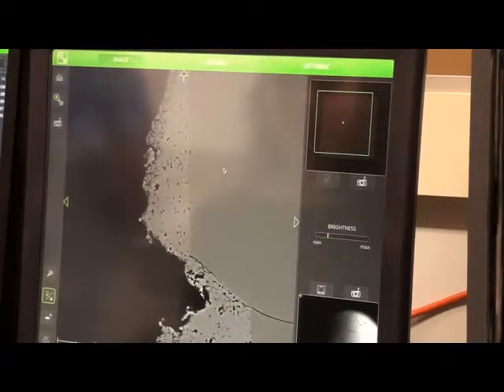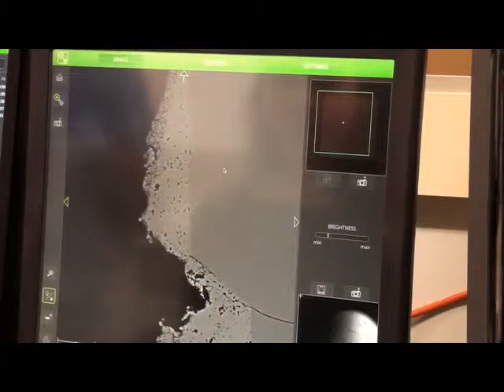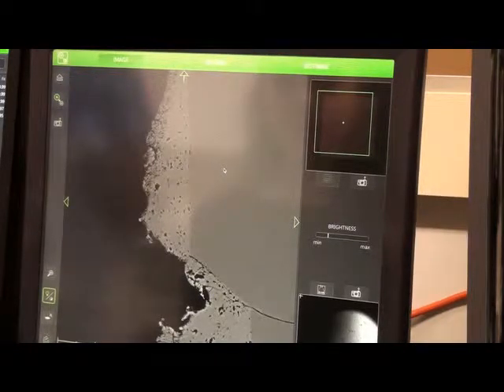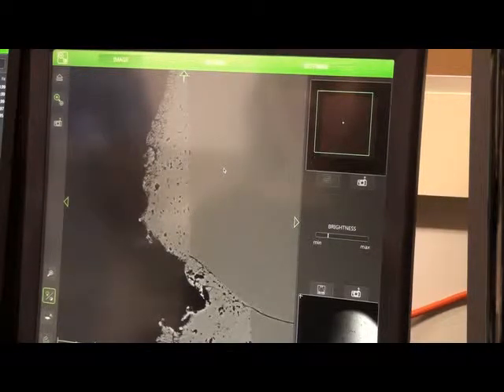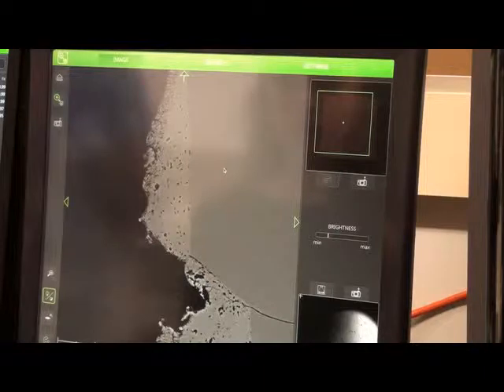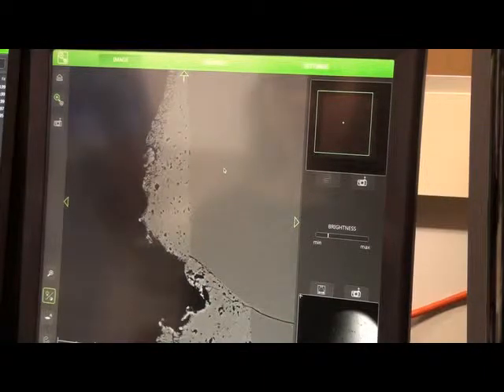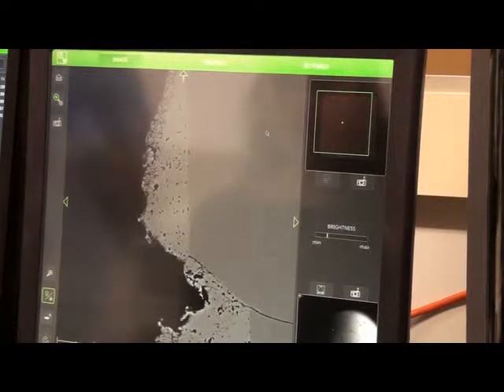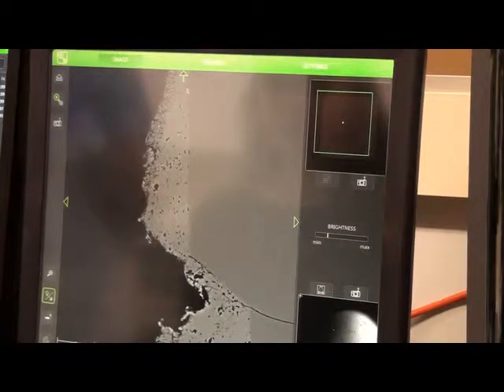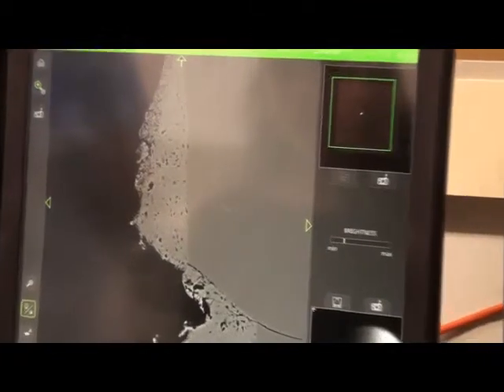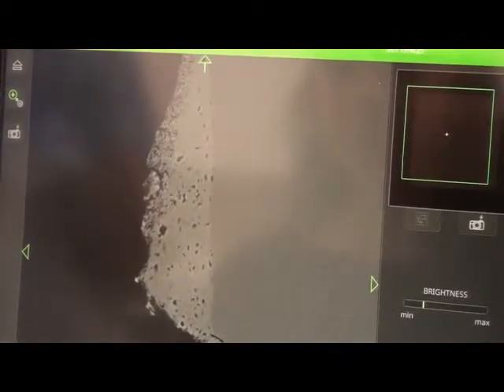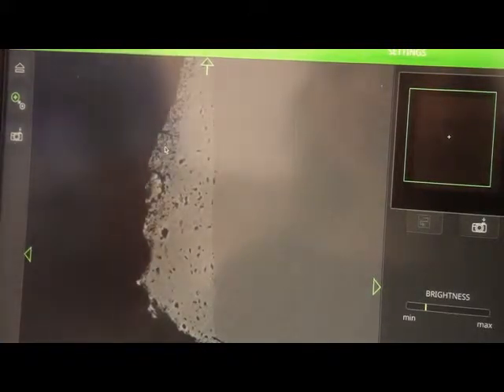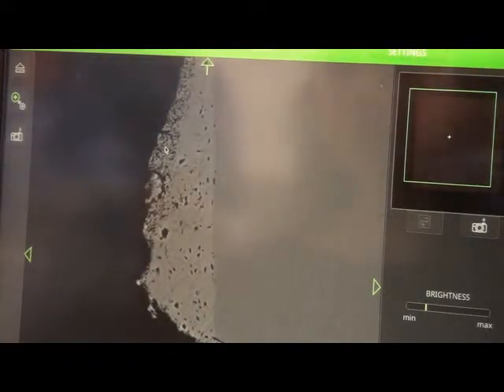We're really just focusing on the oxide and we've adjusted the brightness and the contrast so that you can see it's not really one oxide. You actually have a discrete boundary here between this solid phase and, as you described it, this spongy phase. And there's even a second boundary here where you can see a more spongy effect.